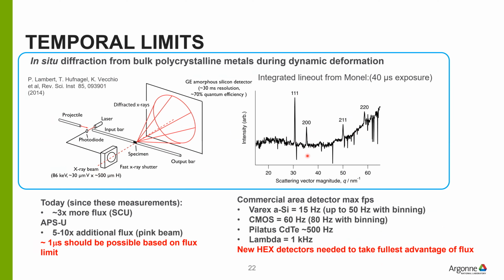Since this period of time, we have 3 times more flux with the improved insertion devices, and also APS-U will be providing 5 to 10 times more additional flux with the white beam, pink beam mode. So in theory, we should be able to reach 1 microsecond type of exposures.